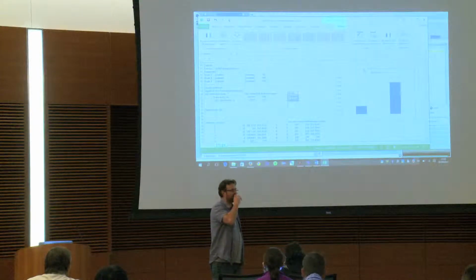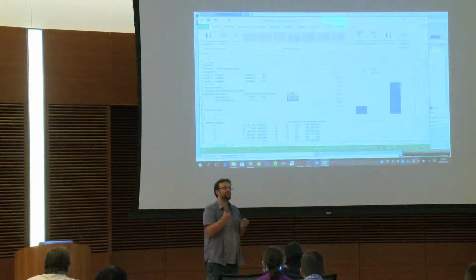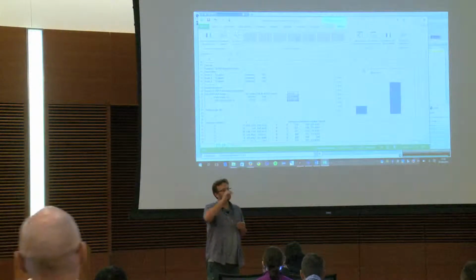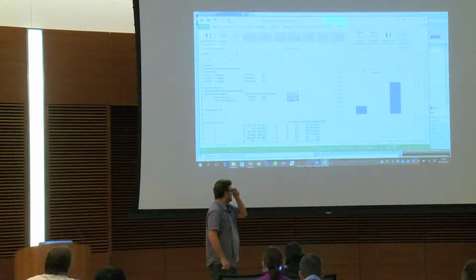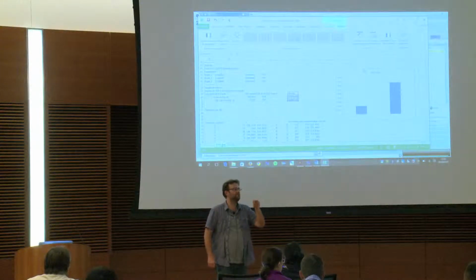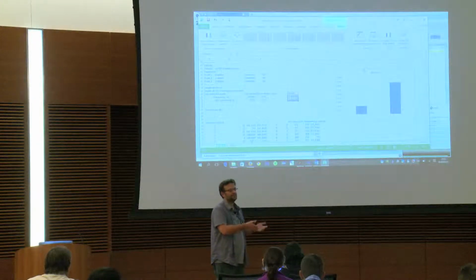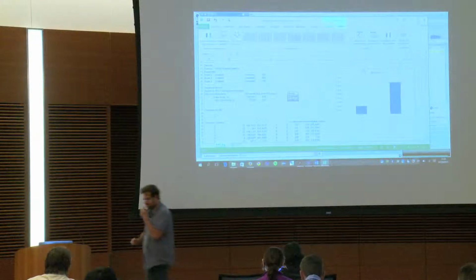So, okay, I get it. It's just because of the shape of the ROI, because everybody is going to draw in a different way. So that's why we also record all the ROIs, to be able to reproduce all the pipeline. So if you are in a high density area and you shift your ROI a little bit, you have a huge effect on your data. In the low density, you don't have this problem.